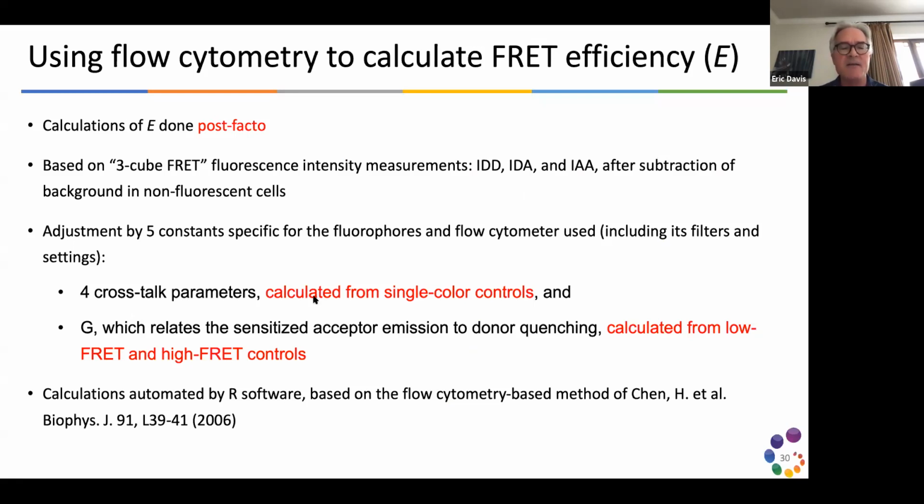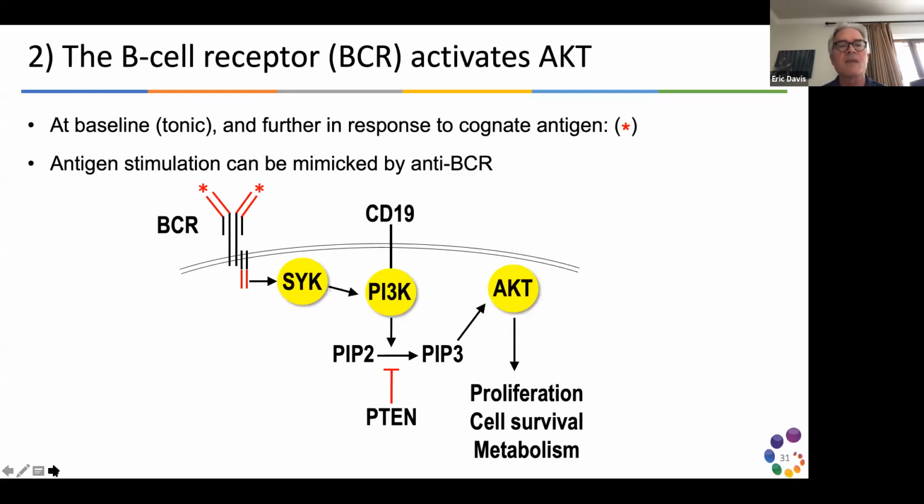With all this data, we wrote some R software, which will automate the calculation of the FRET efficiency.